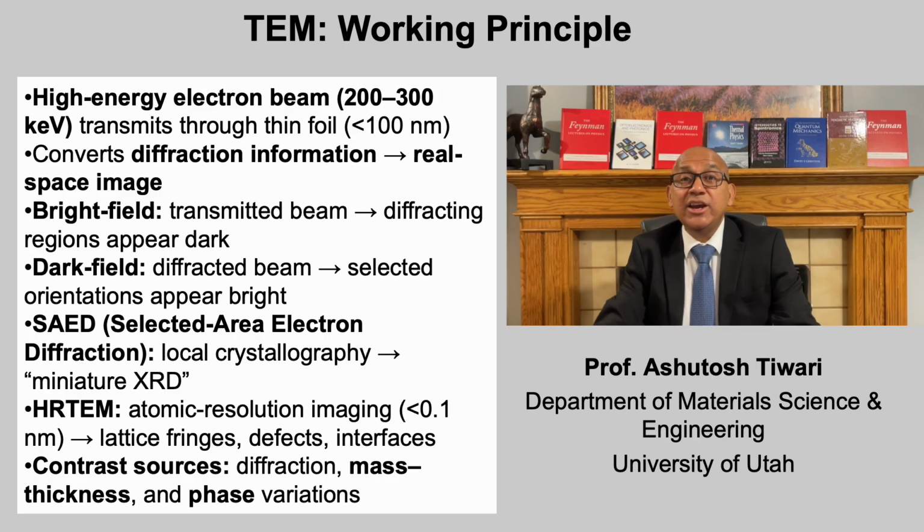At higher magnifications, high resolution TEM, HRTEM, pushes the resolution below 0.1 nanometers, allowing us to visualize lattice fringes, interfaces, and defects such as dislocations or stacking faults.